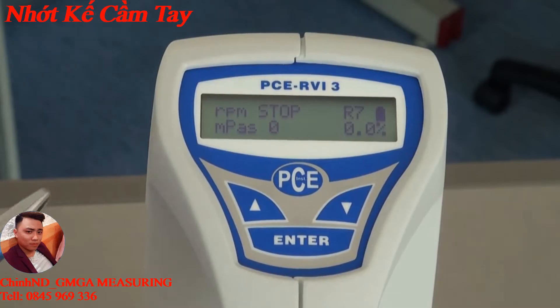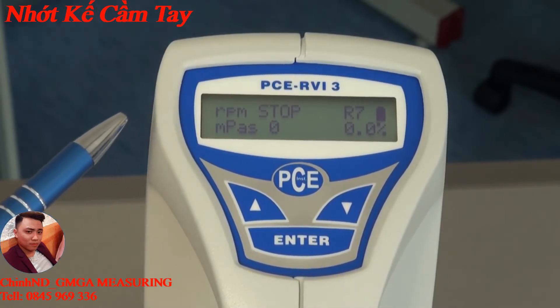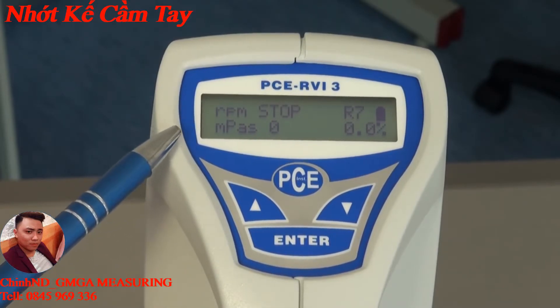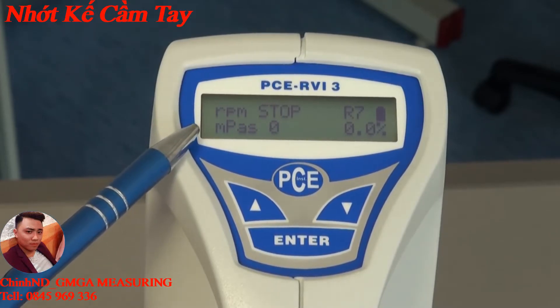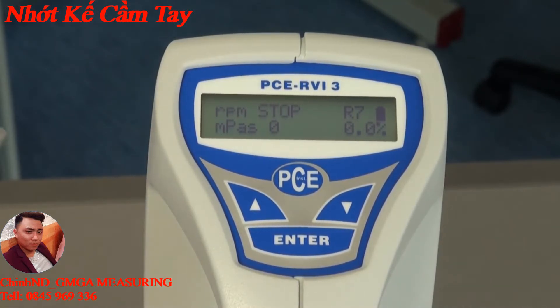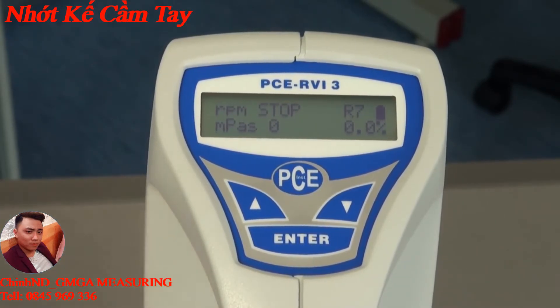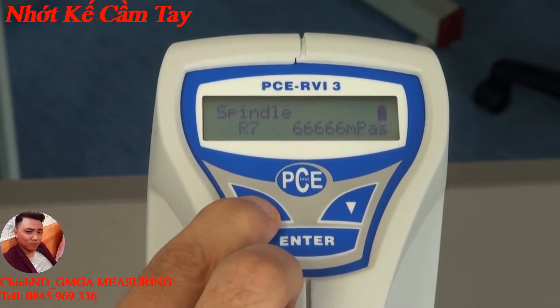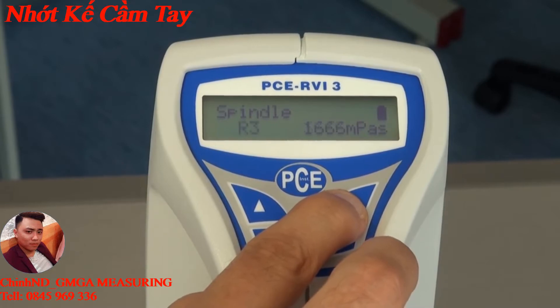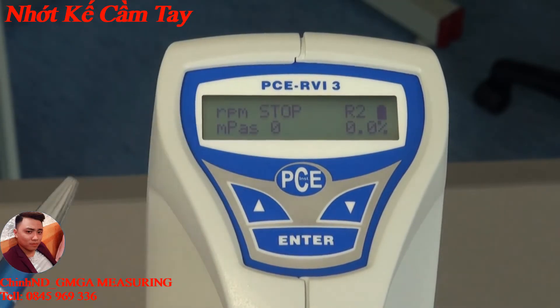On the display, at the top you can see the revolutions per minute. The PC RVI3 is available in two models: one with 20 revolutions per minute and one with 60 revolutions per minute. Underneath the RPM the measured viscosity is shown — currently at zero because the device is not running. The spindle number is displayed at the top and can be set using the arrow keys. For example, spindle number two can be selected and confirmed by pushing the enter key.